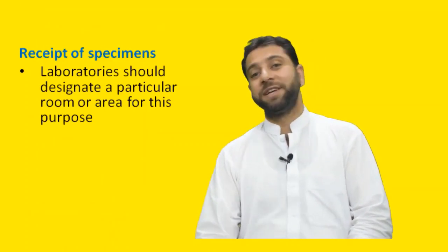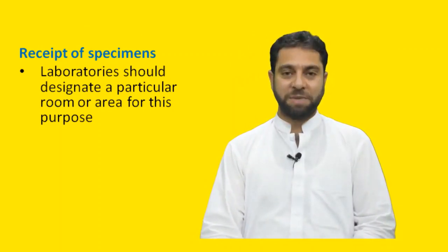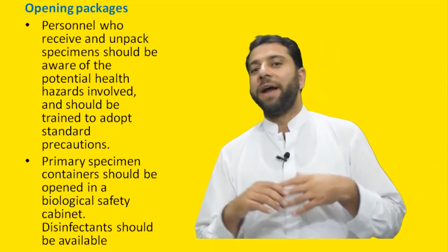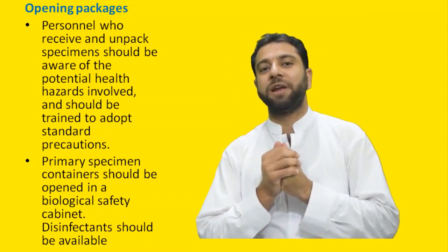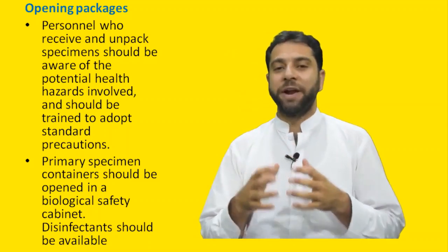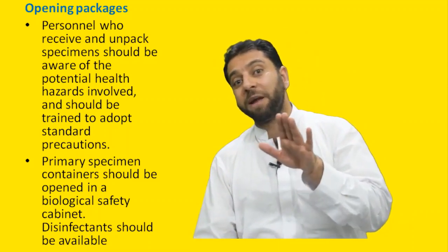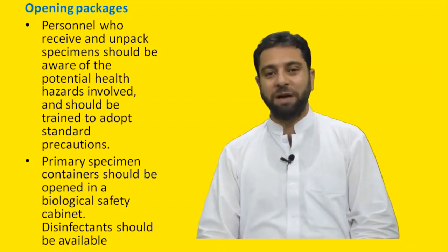The laboratory should designate a particular room or area for the receipt of the specimens. Personnel who receive and unpack the specimens should be aware of the potential health hazards involved and should be trained to adopt standard precautions. The primary specimen containers should be opened in a biological safety cabinet where disinfectants should be available.